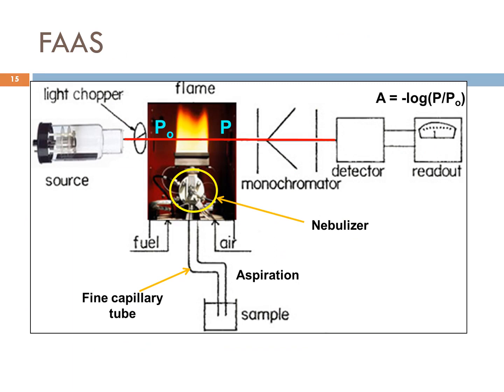Okay, this is once again. From this source, it will only emit the characteristic radiation.